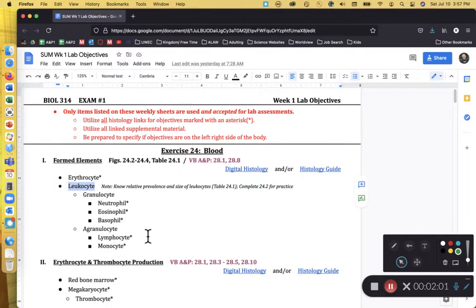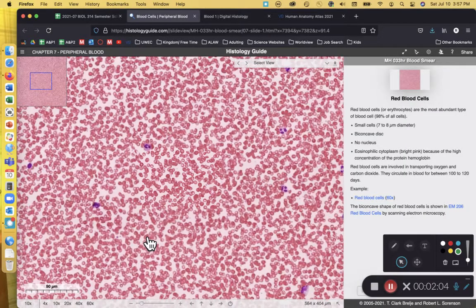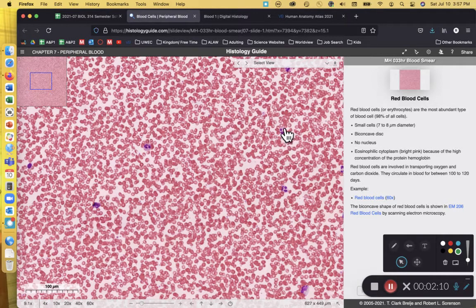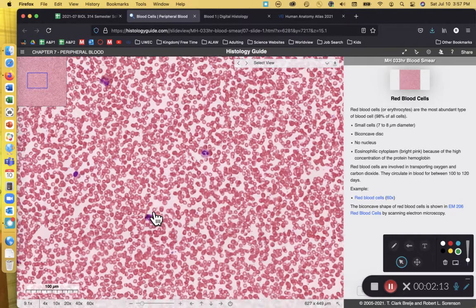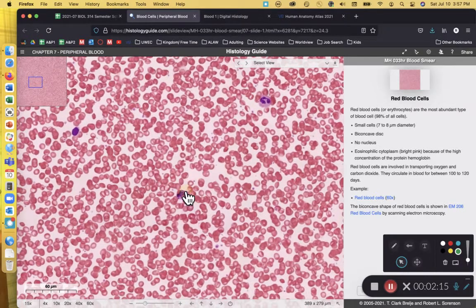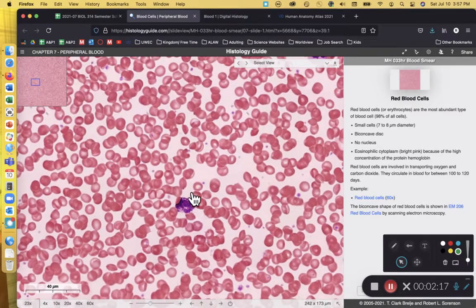Now let's look at leukocytes or white blood cells. If I zoom out here, you can see these purple cells that have nuclei. These nucleated cells are going to be the leukocytes. I should also mention that the erythrocytes do not have any nuclei — they are anucleate cells.